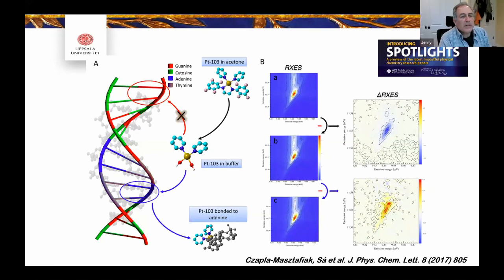Yeah, no, I wasn't thinking valence to core. I was thinking about, I can't remember the name of the scientist in Japan, I apologize. He's written a number of papers that discuss how you can generate RIXS data if you know the non-resonant X-ray emission and the total fluorescence yield XAS. There's a standard formula from quantum mechanics that would let you generate the RIXS plane as long as there are not many body effects. Okay. So it won't get things quite right in the pre-edge and maybe even at the white line.